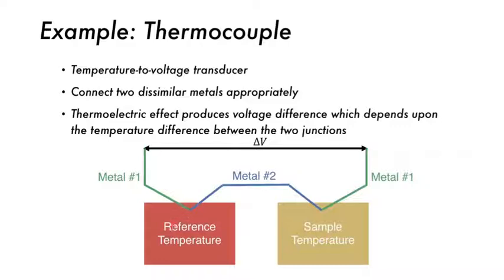And we have some sort of reference material, usually a platinum reference material. This has a temperature which we know very well, because if we pass a certain current through this reference material, say 2 amps, it will produce a temperature which we have recorded ad nauseum.